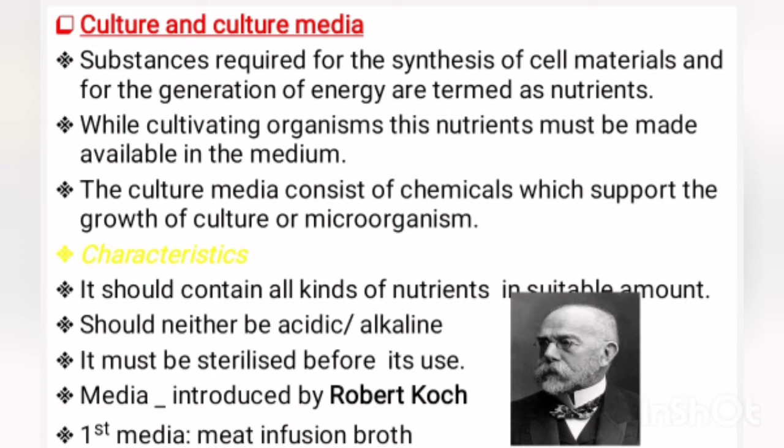The media was introduced by Robert Koch. Meat infusion broth is the first introduced media. Petri dishes are used for preparing the Petri plate. Petri plate means a Petri dish containing media. It was introduced by Richard Petri.